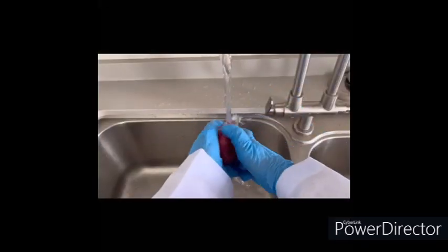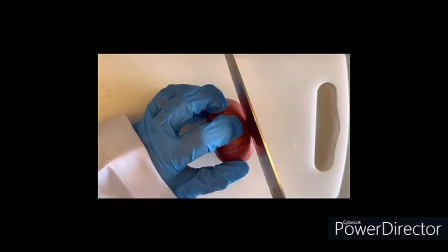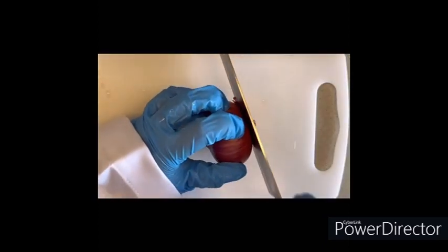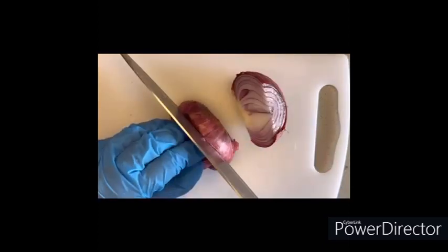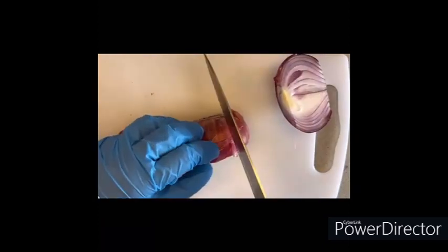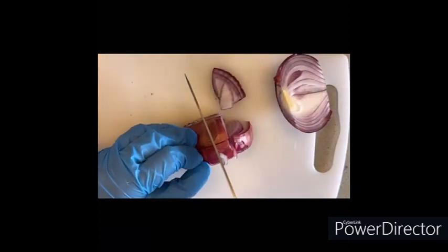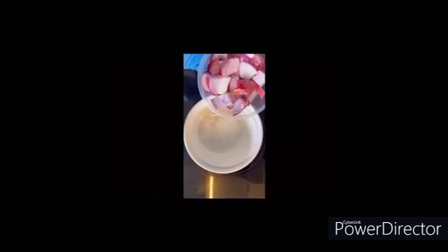Wash the onions thoroughly to discard soil and impurities. Then, using a clean cutting board and knife, cut the ends of the onions and discard them. Next, safely cut the onions into small pieces without removing the skin, as the skin contains the most anthocyanin. Place the cut onions into a glass container or preferably a beaker.